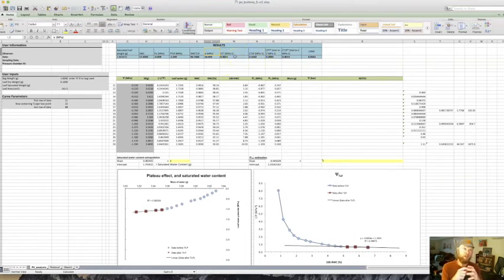So how much of a change in the pressure occurs relative to how much water is being lost. This is the capacitance at turgor loss point. And then these two values in O and P are the capacitance at full turgor and turgor loss point normalized by leaf area. The reason these are in here is because they're for another type of measurement we do, we need that data. But for the most part, we won't present it. You wouldn't present this data.